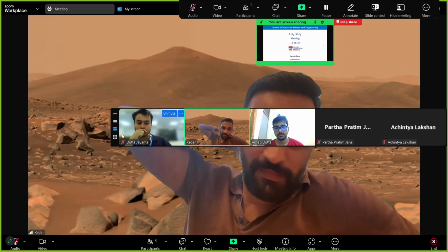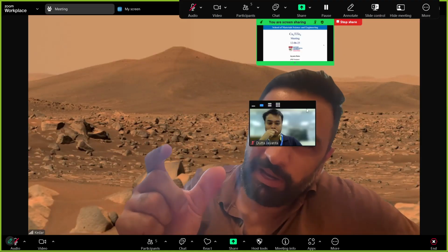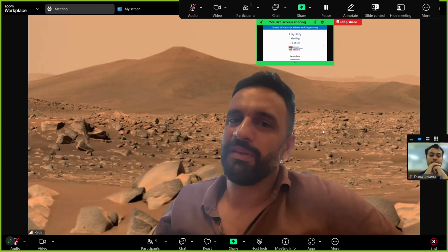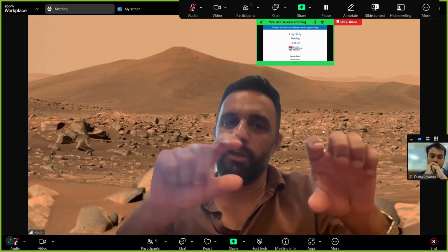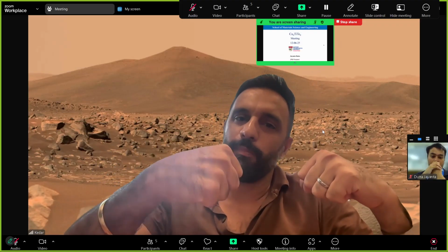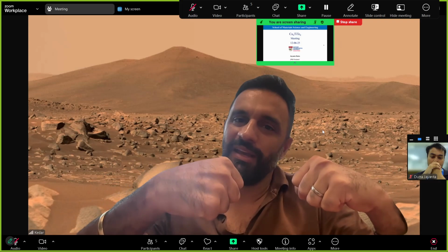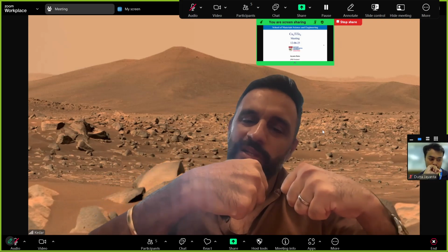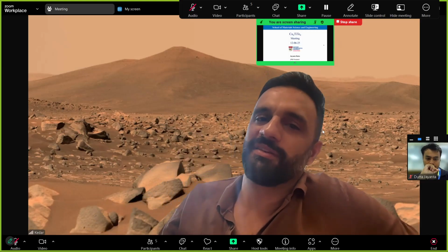But forming these bulk materials, right? The one that Jayanta is using, we have a spring. This is something we invented. Cheng Guang invented this idea. This doesn't exist. You basically put it in the tube, and then it's under compression already. Okay. And then when it goes to melt, it compresses further. We haven't measured the pressure, but that causes it to be fully dense. I think that's the beauty of the synthesis.